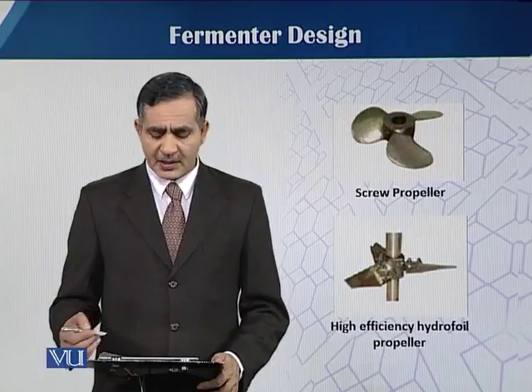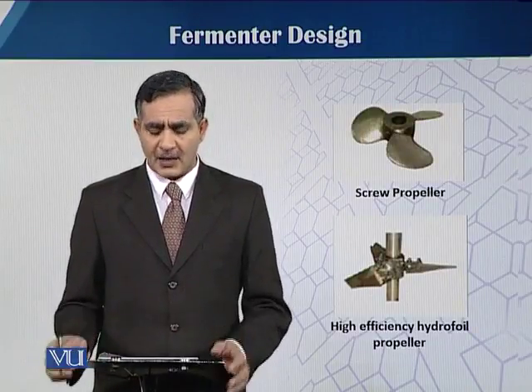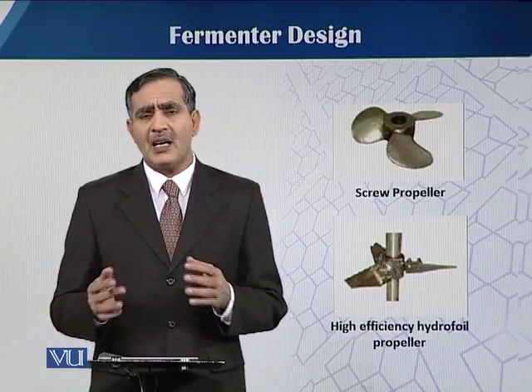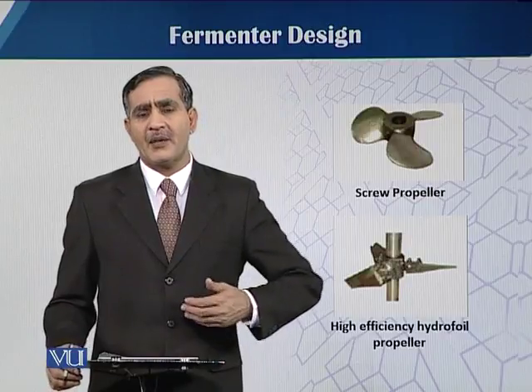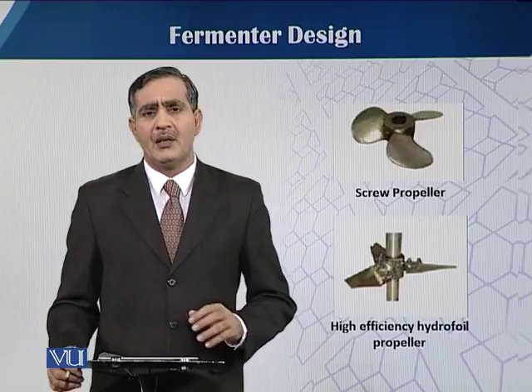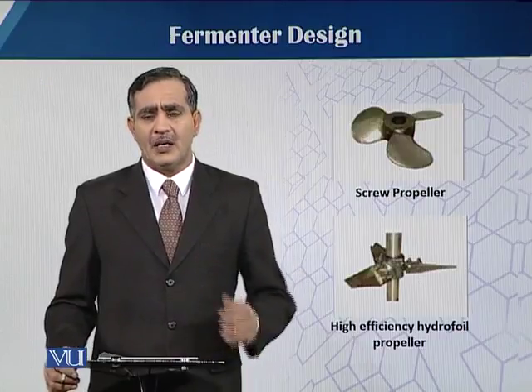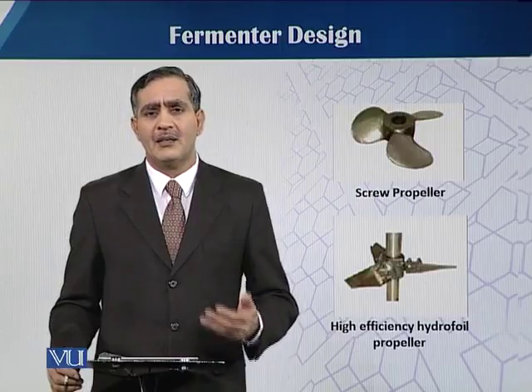In this diagram you can see axial flow impellers having different shapes of blades. These are the different impellers which are used in designing fermenter vessels. Because mixing in a fermentation process is very critical, while designing the fermenter we have to be very careful in fixing the impellers.